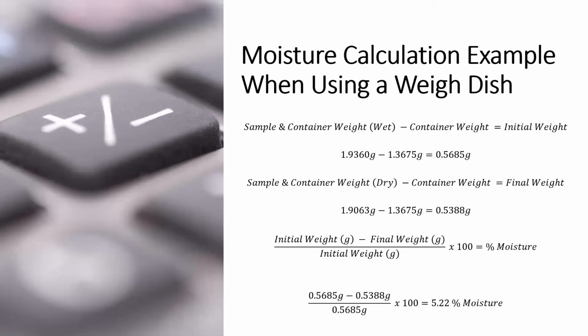And the reason for that is during our method validation process and method development, we determine the ideal sample weight we're looking for is about 0.4 grams to 0.6 grams of wet material. This will ensure that a 3.5-hour drying period is enough time to fully remove the moisture from the sample and ensure that the sample is taken to complete dryness.